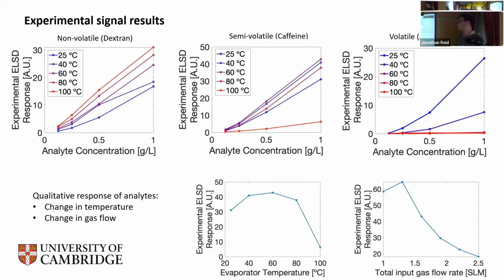What happens is, if we follow them through, this is the 25-degree line, and the signal intensity starts to increase as you increase the temperature. You reach a zenith, you reach a peak, and then it starts to drop off again as it becomes more volatile, which is this sort of behavior that is put down here. So it reaches a peak and then comes back down with temperature.